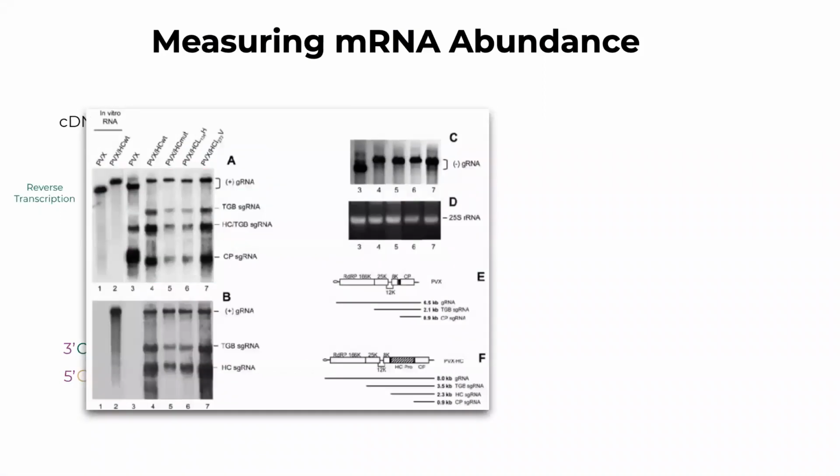Then we talked about northern blotting, which is when an RNA sample is digested into fragments that are separated by size in gel using electrophoresis. And they are then transferred to a membrane that can be probed to test for the presence of a hypothesized RNA transcript. So again, you have to specify which RNA transcript you are interested in.